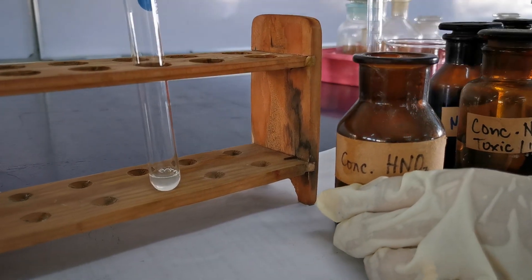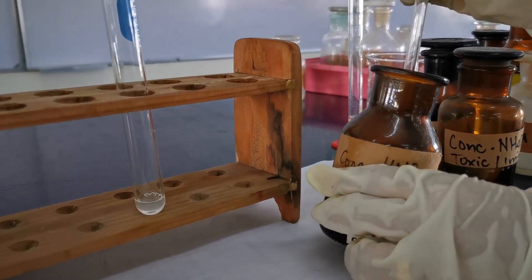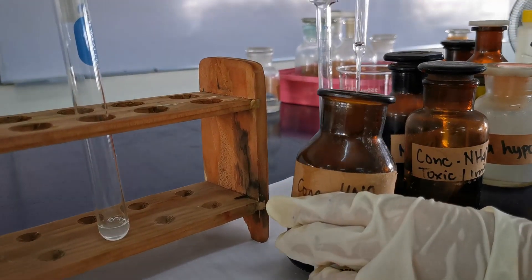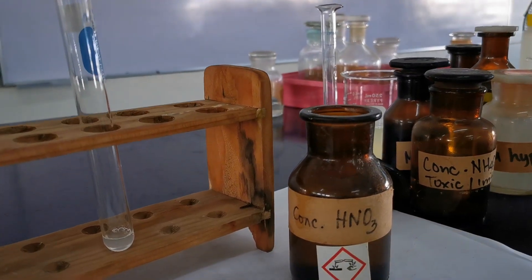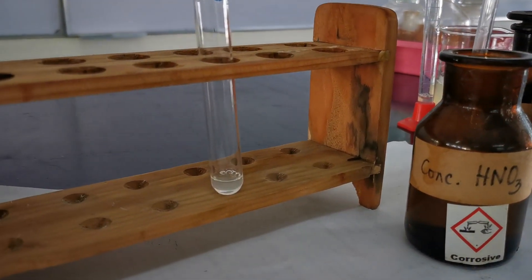Using the graduated cylinder, place 1 ml of egg albumin solution in a test tube and add 5 drops of concentrated nitric acid using the droppers.